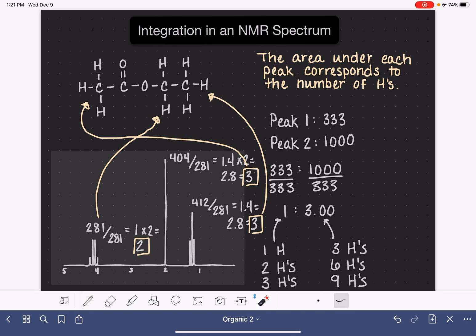However, for this particular molecule, there isn't really any way, if we didn't have this sort of reference, we wouldn't know if the true ratio was 2 to 3 to 3 or if the ratio was 4 to 6 to 6 or if the ratio was 8 to 12 to 12. We don't have any way of knowing that by looking at just the NMR all by itself. We need a little bit extra information, such as the mass spec, to help us figure out which of these ratios is accurate.